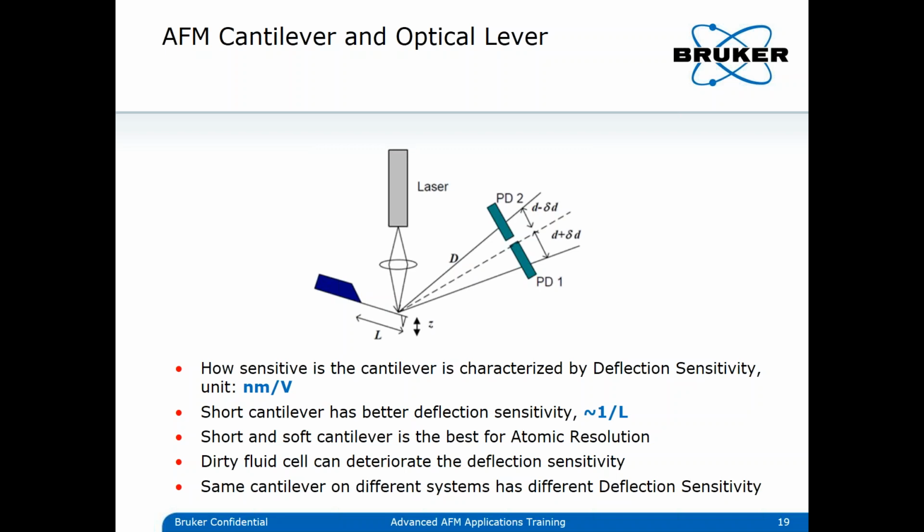If you come from a Multimode and go to an Icon, or vice versa, the deflection sensitivity for exactly the same cantilever will be different, because mainly the laser path is different, meaning longer or shorter.